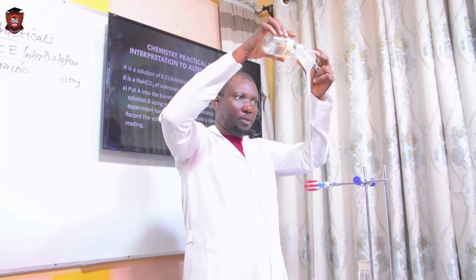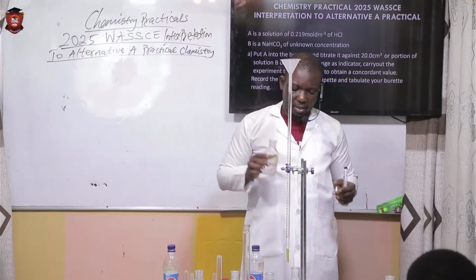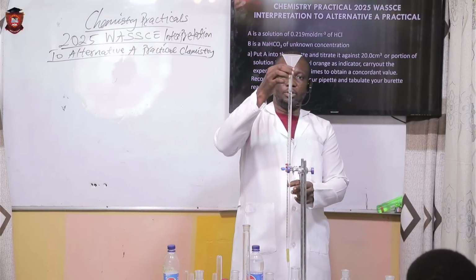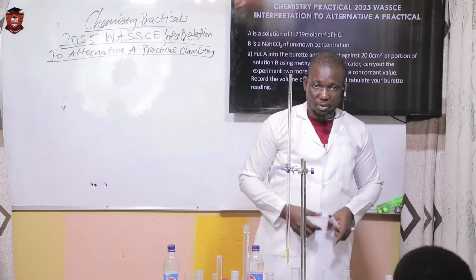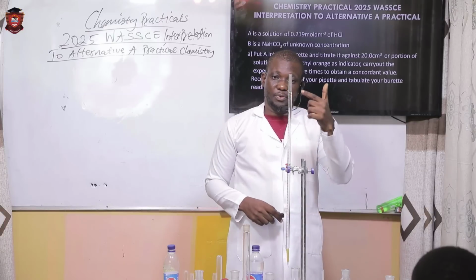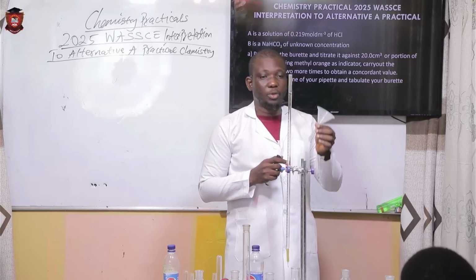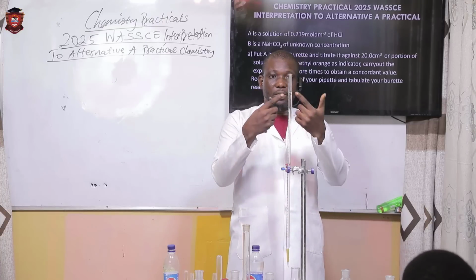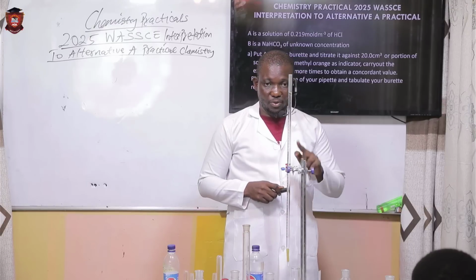And make sure that you don't allow it to get filled up to the brim. But I think this is okay. Immediately after putting this into the burette, please try to remove your funnel. There is one reason why you are removing this funnel. Supposing that you didn't remove the funnel after putting A into the burette, there may be more drops. Maybe after taking your initial reading, one drop from the funnel may have increased the volume, and that will affect the reading. So that's why you have to remove the funnel.